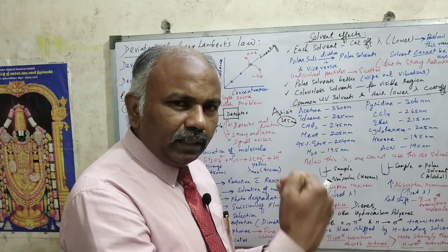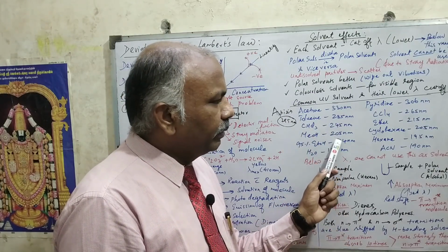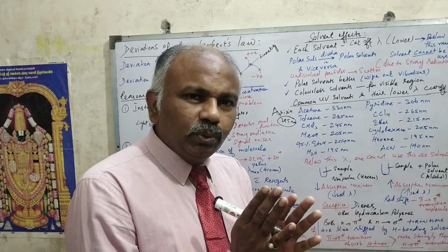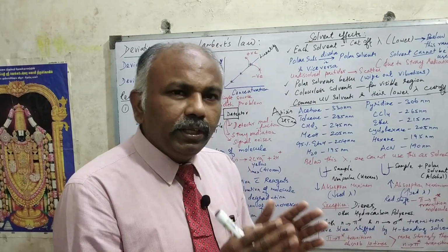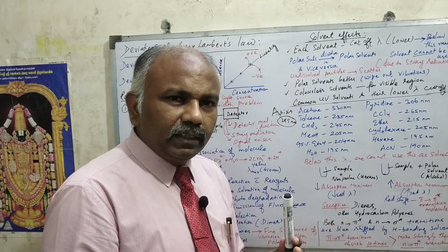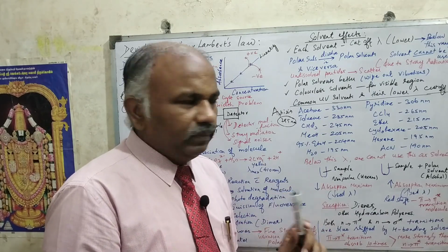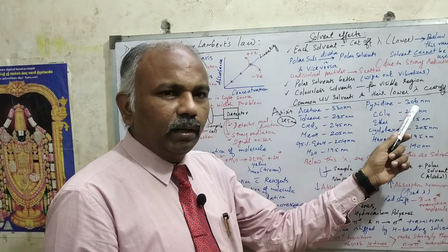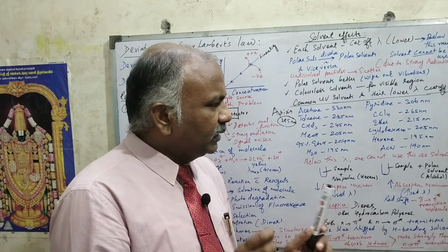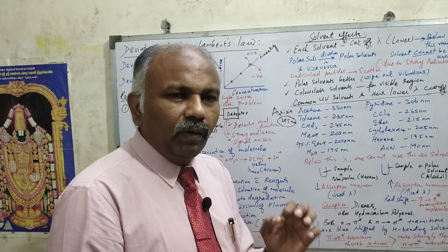Below the lower cutoff wavelength region, this solvent will not be a better solvent as such. That means whenever you choose the solvent, it should be used in such a manner that it has the lower cutoff wavelength region. Below that region, you should not use any other solvent as such. If the wavelength region is 306 nanometer, below that region, you cannot use pyridine as a solvent. So that is a very, very important criterion one must use for choosing the right solvent for doing UV visible spectrophotometry.